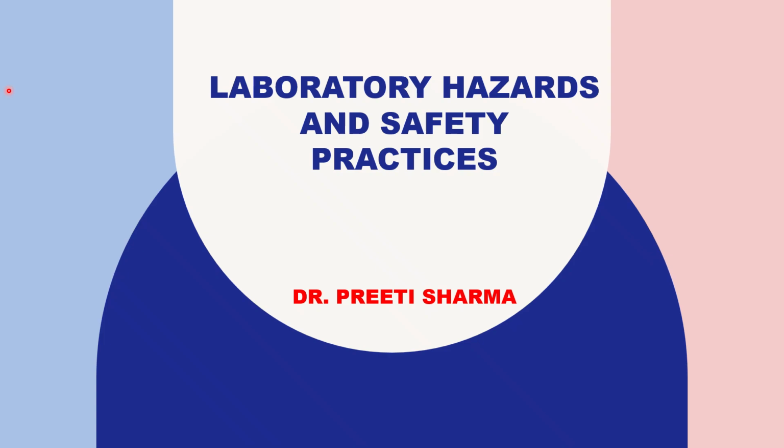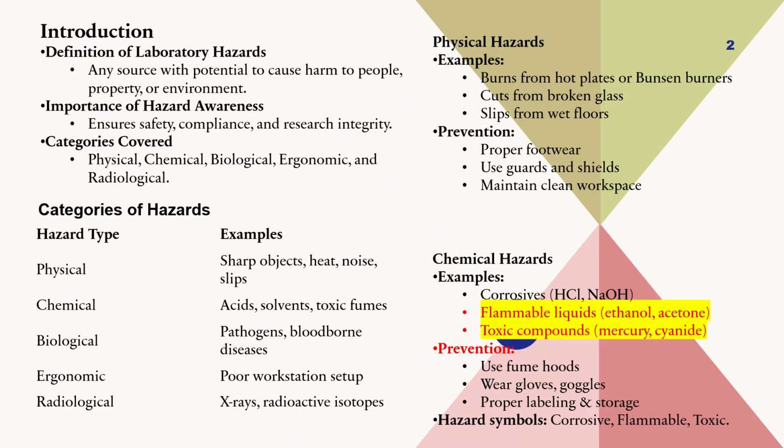So today we will discuss laboratory hazards and safety practices. Good laboratory practices are an integral part of conducting laboratory work. So let's discuss one by one, what is the definition of laboratory hazard?